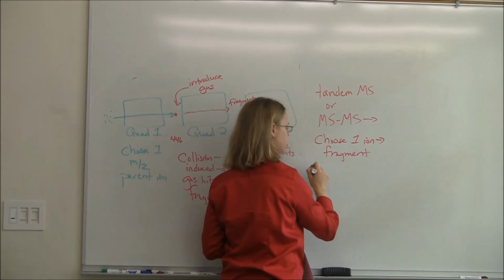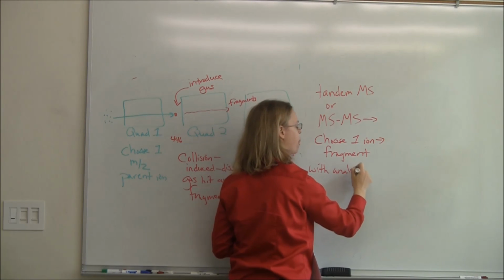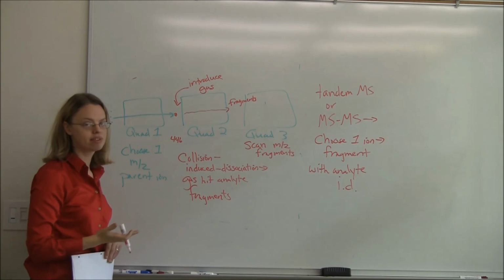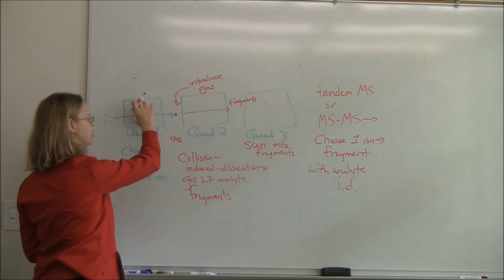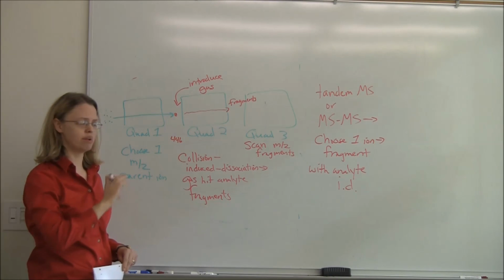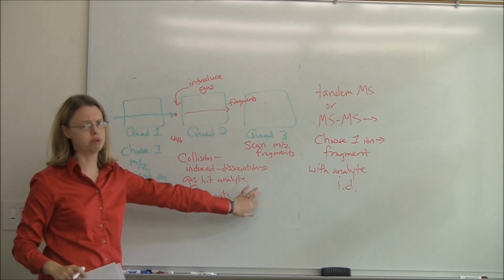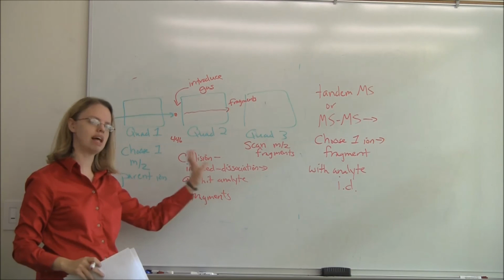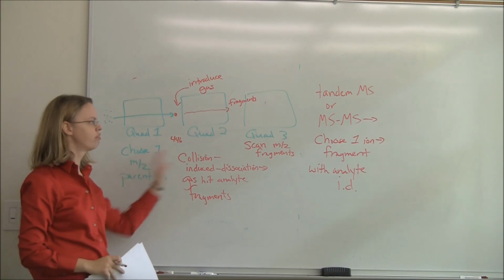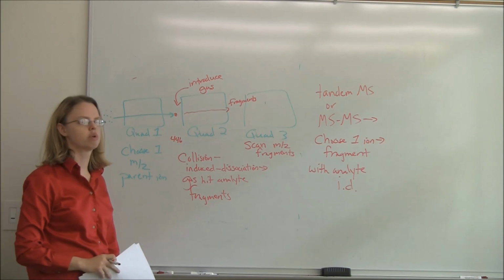And this helps substantially with analyte identification. Because, again, to the resolution of just one quadrupole, many things can have about the same molecular weight. You start fragmenting it though, and then you can tell by the fragments what you're looking at. So this is what a lot of people do in mass spec. As I said, we don't have a triple quad in this class, but you can really understand the power of mass spectrometry and the sort of future of identification, and that's what they're doing with these triple quad mass specs.